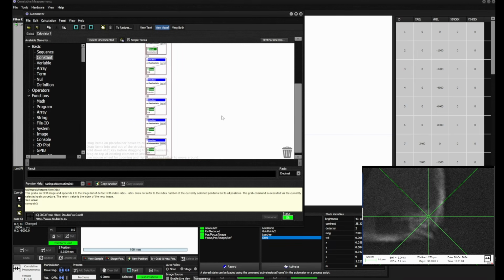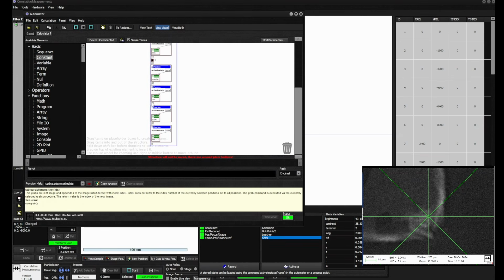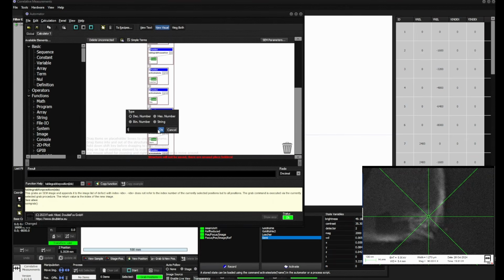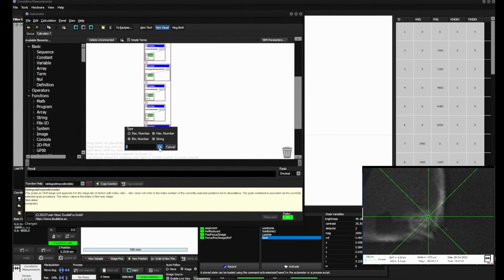And the last thing is then to grab the image. This should be done after the 90K. So we want it here, we want it there, and we want it also here. Where do we have it here? This one goes here. We make it number 1. This one goes here. We make it number 2. And then the last one goes here. We make it number 3.